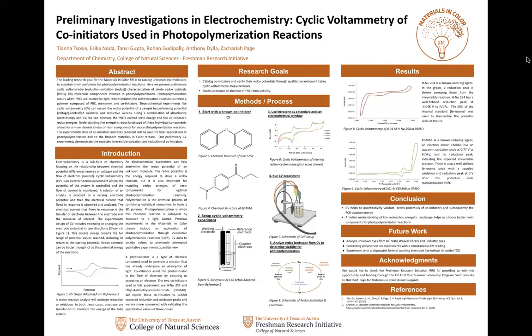The electrochemical cell is made out of glass with a cap to fit 3 electrodes. The solvent contains an electrolyte, which allows the current to pass through the solution. Once the cell is prepared, we add ferrocene as an internal standard to center the electrochemical window. The peaks from the CVs were then analyzed for further investigation.